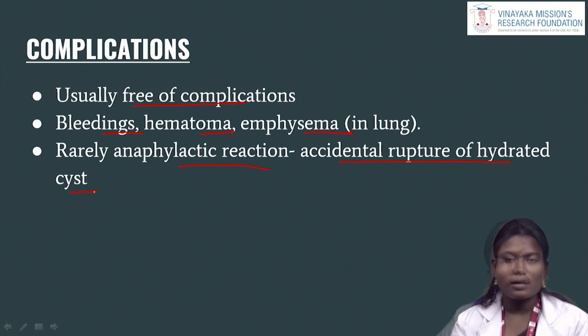For smear preparation, there are two methods, dry and wet. In the wet method, we prepare the smear and fix it in fixative solution. In the dry method, we make the smear and allow it to dry in the laboratory without contamination, and then introduce it into the routine and special stains. The routine stains are H&E stain, May-Grünwald Giemsa stain or Romanowsky stains, or Papanicolaou stain. The special stains are PAS stain, amyloid stains and Ziehl-Neelsen stain.